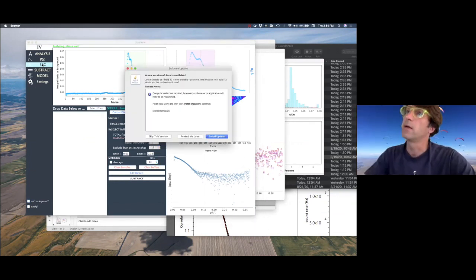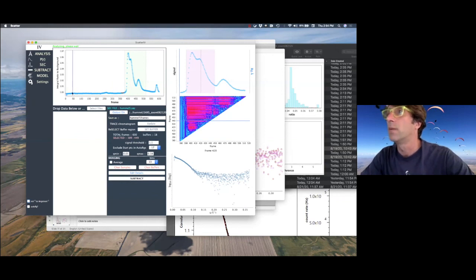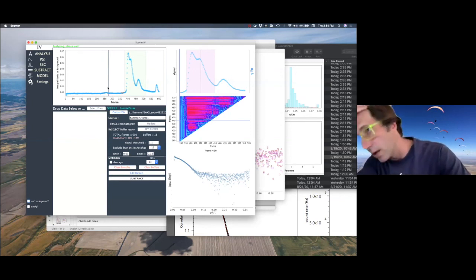Susan had a good comment, and I will probably mention that. Our size exclusion SAXS mail-in wasn't all the time perfect, and some users had a complication to really subtract the data because our baseline drifted based on the temperature of the hutch. And so we kind of sorted it out.